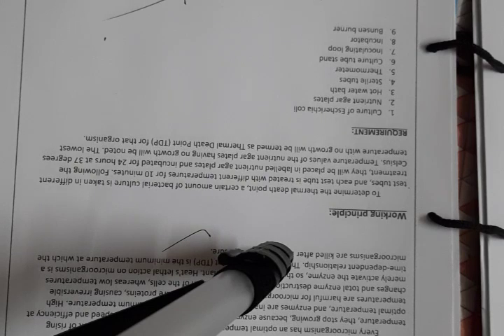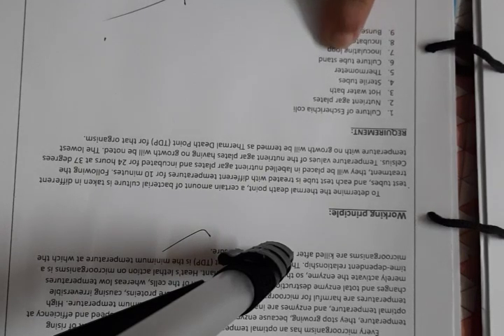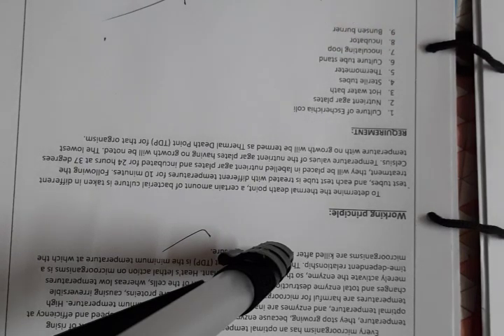And then we need the culture tube stand. And then what do we need? We need an incubator. Yes, we need an incubator for allowing it to grow at 37 degrees Celsius for 24 hours.